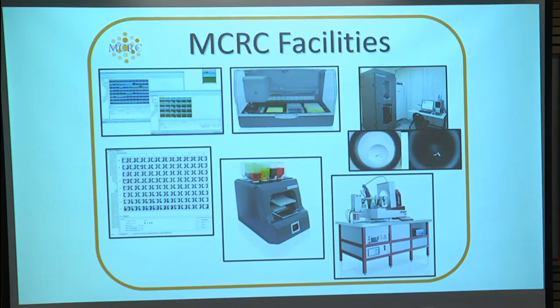After the plate is set, it goes to the imager, which can accommodate 1,000 plates. The advantage of it is that it has a regular camera and a UV camera. So if you have protein crystals, it can be an initial indication that this is indeed protein and not salt crystals. We also have a website in which you can see and follow all the crystallization plates, which is very convenient instead of looking at them under the microscope.